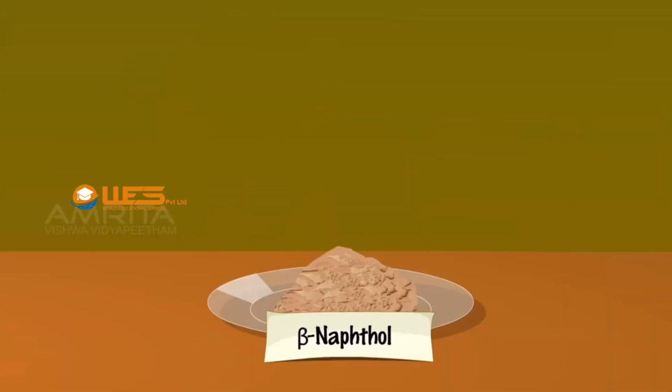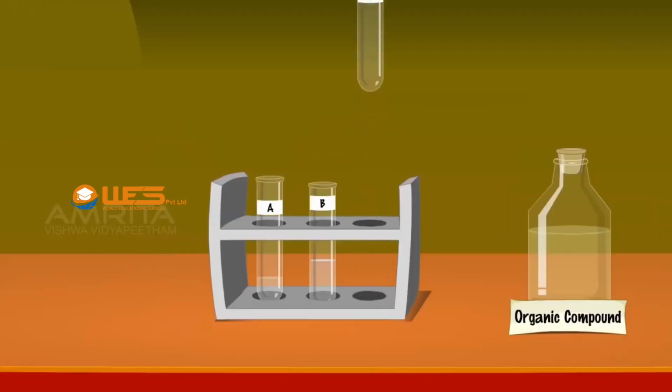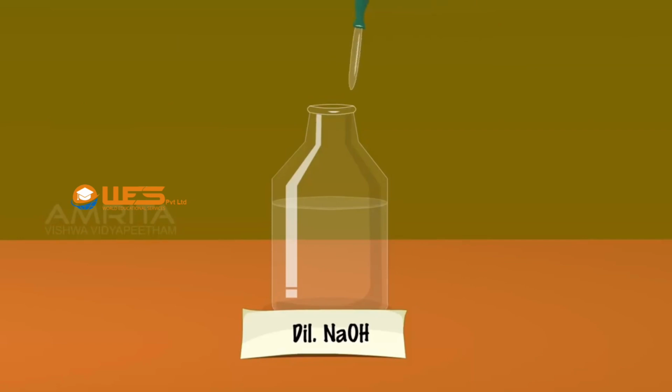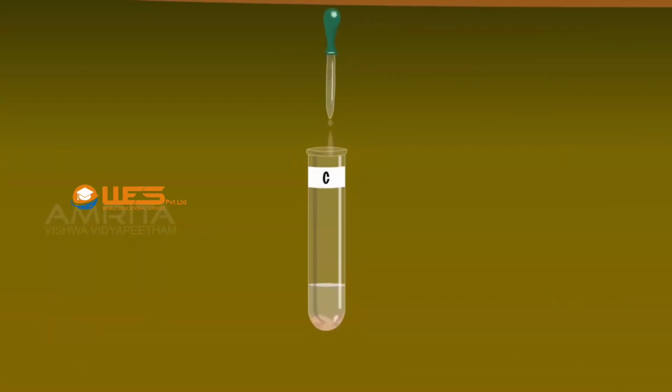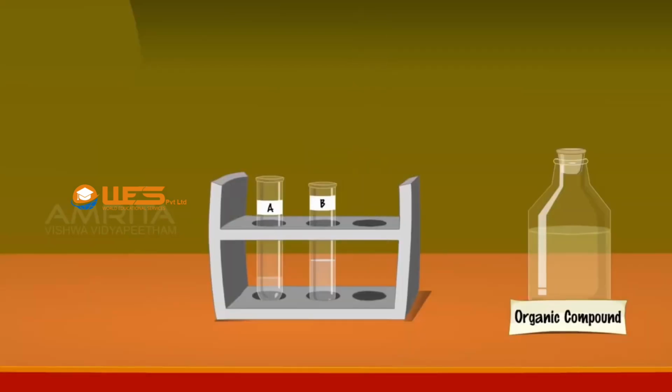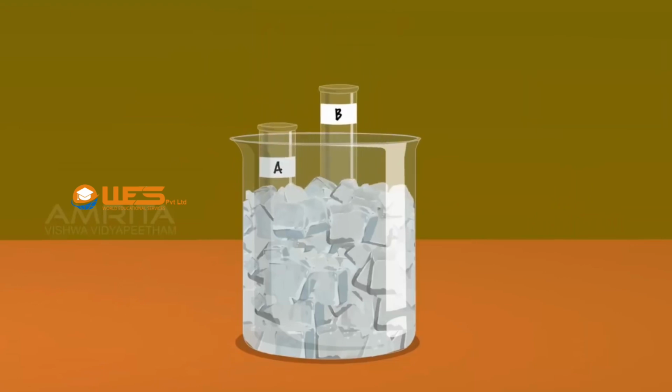Using another spatula, take a small quantity of beta naphthol. Transfer it into test tube C. Using a dropper, take a small quantity of dilute NaOH. Add it into test tube C and shake the test tube well to dissolve naphthol. Take the test tubes, place them in an ice bath and cool the test tubes for some time.